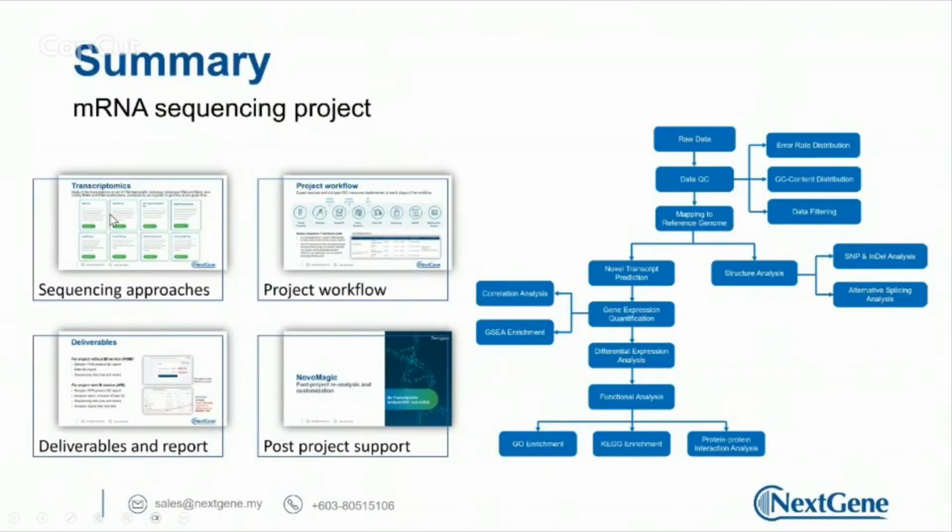To summarize everything, we have gone through the available sequencing approaches and the solutions provided by Novogene for transcriptomics. We have also looked into how the projects will be conducted, how the analysis will be carried out, what analyses are included in the projects, and what support users will receive after the projects. With that, thank you everyone for staying with me in this session. So yeah, passing back to you, Mickey.